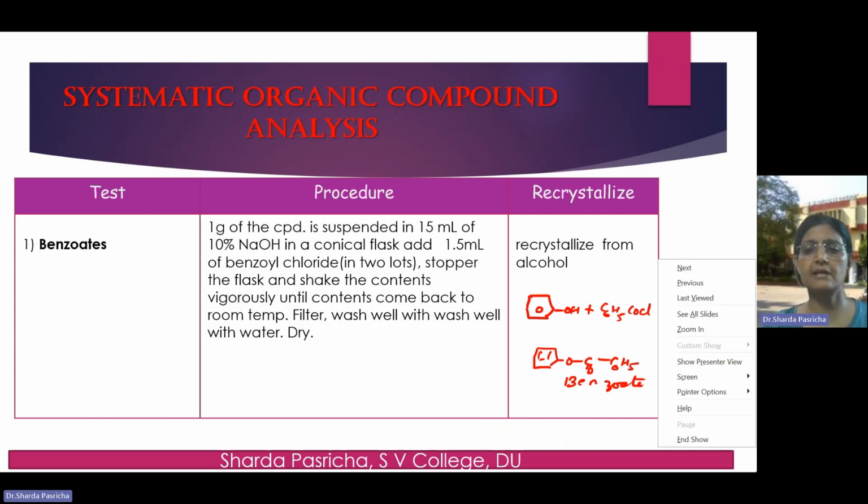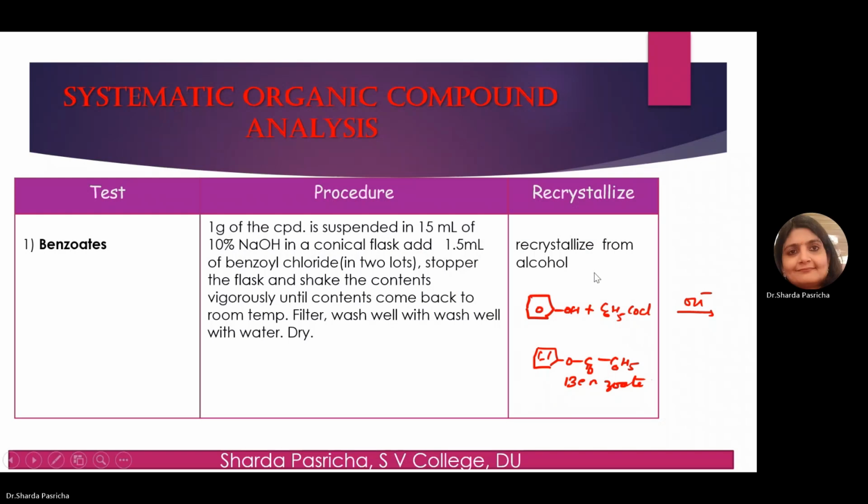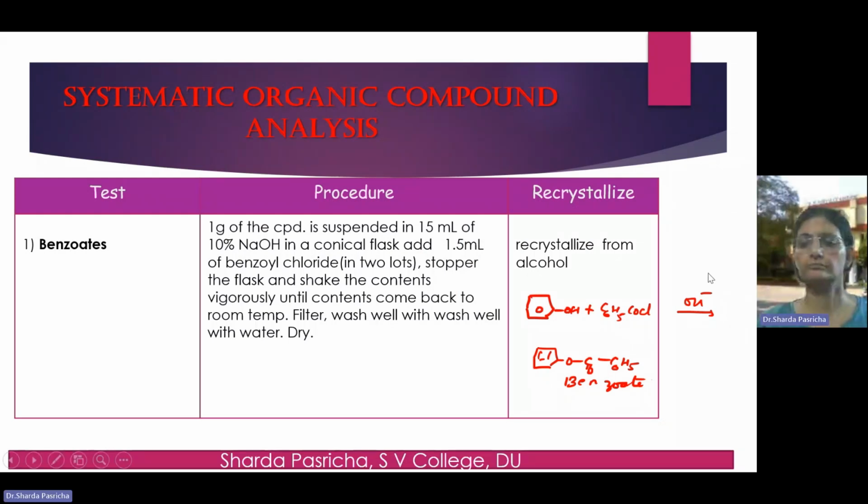Okay, so let us understand how this reaction is taking place. How do we do this benzoylation reaction?